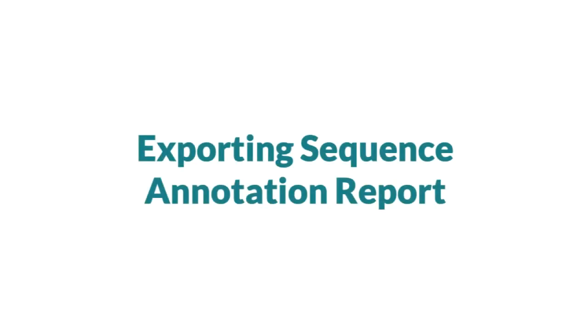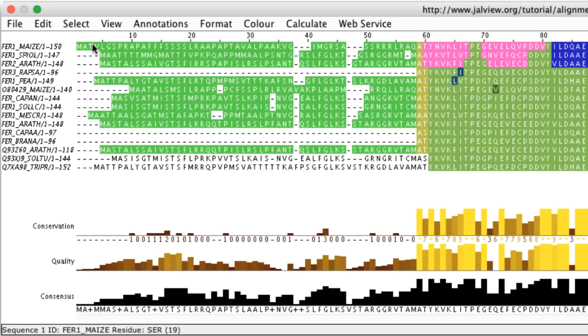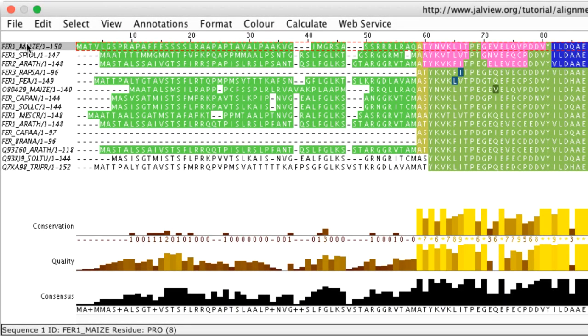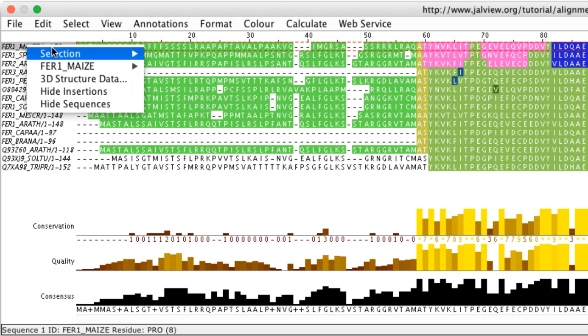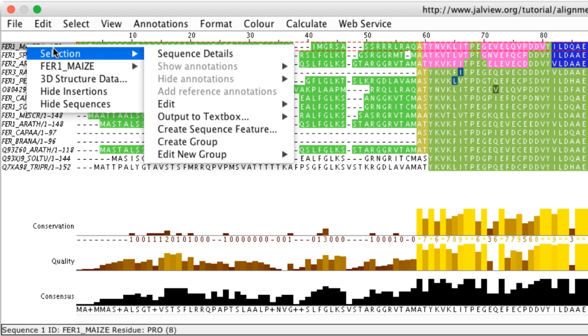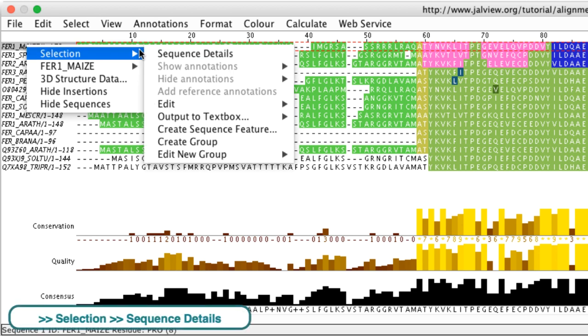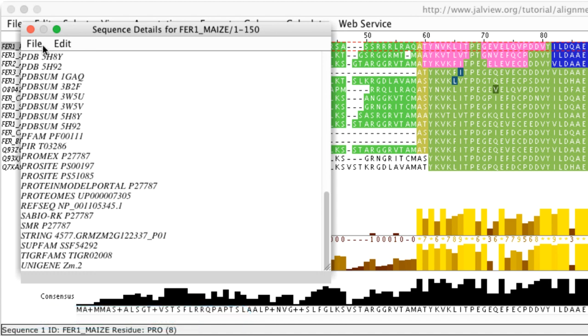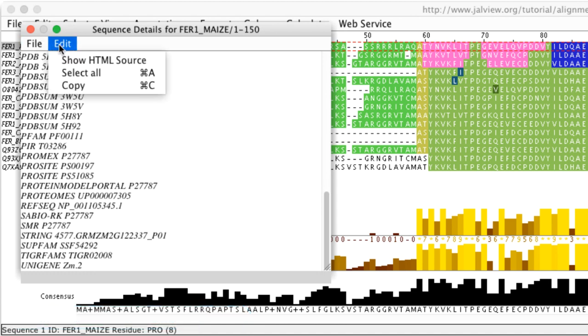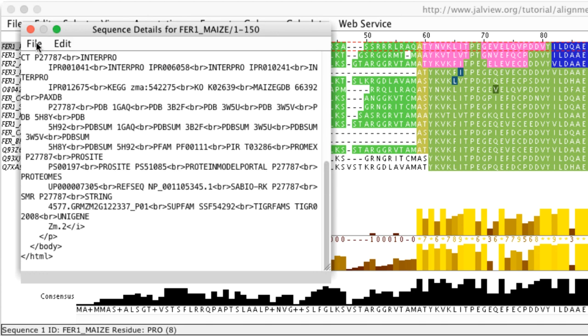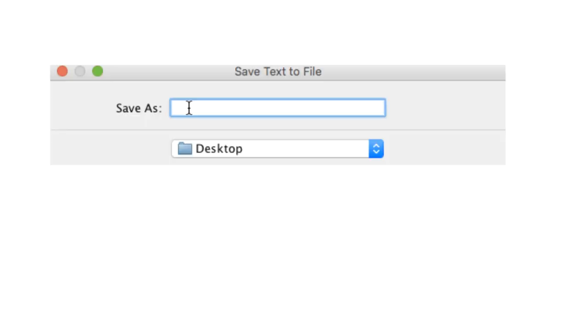Additional information retrieved from databases such as ontology terms, cross-references, links to publications can also be exported. Place the cursor on the sequence ID text and right click the mouse and select selection and select sequence detail option in the pop-up menu. This opens the sequence details window. The text can be viewed and saved. If the HTML option is used the file can be opened in a web page.